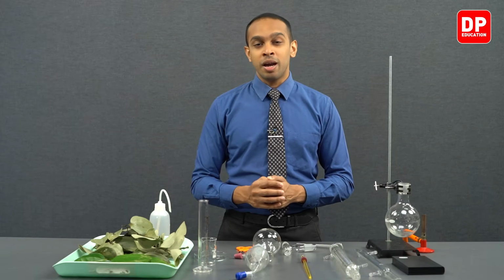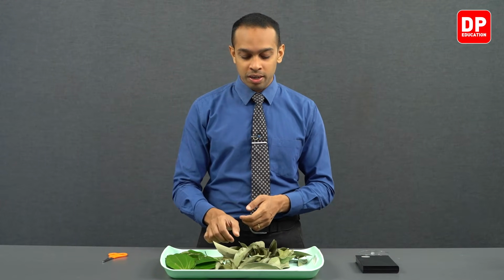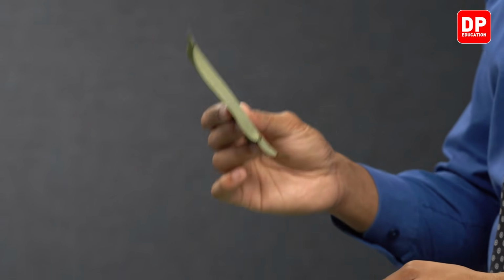Now that we have identified the equipment and the raw material we will be using for this experiment, we can now move on to actually carrying out this extraction process. Now students, we are going to be taking these dried cinnamon leaves and cutting them into small pieces, and we'll be using a round bottom flask to carry out the distillation process. So after weighing the right amount of cut pieces of cinnamon leaves, we'll be transferring them into our round bottom flask.